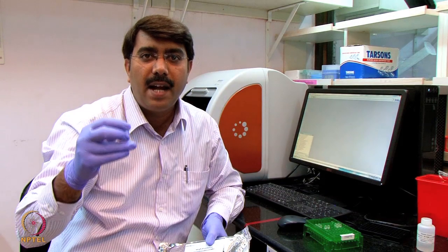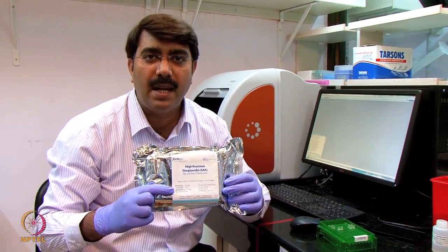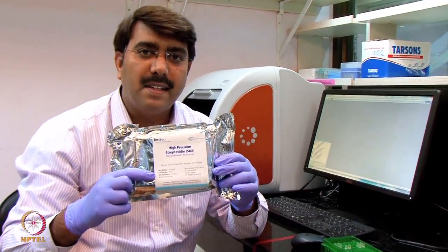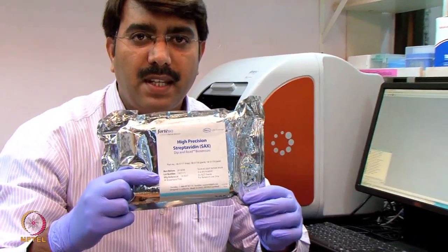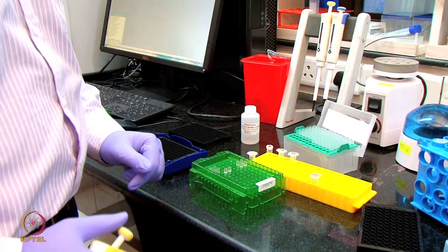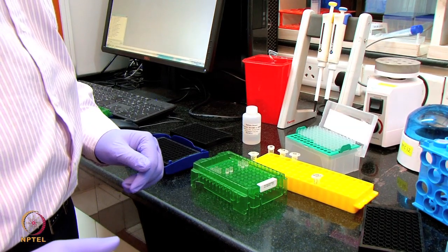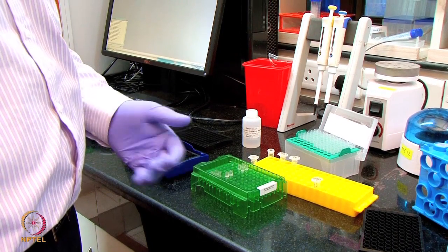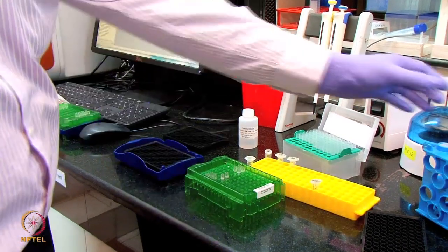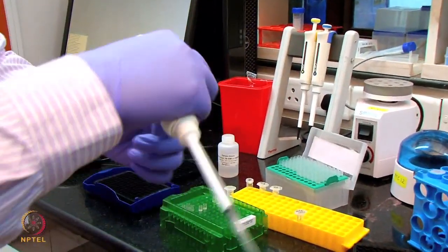I am going to use the biotinylated antibody for immobilization of the antibody onto a streptavidin sensor. This is the streptavidin sensor I am using for the immobilization step. So in this experiment, we are using a streptavidin sensor. The streptavidin sensor has to be hydrated before the immobilization. Now I am going to do this hydration of the streptavidin sensors.